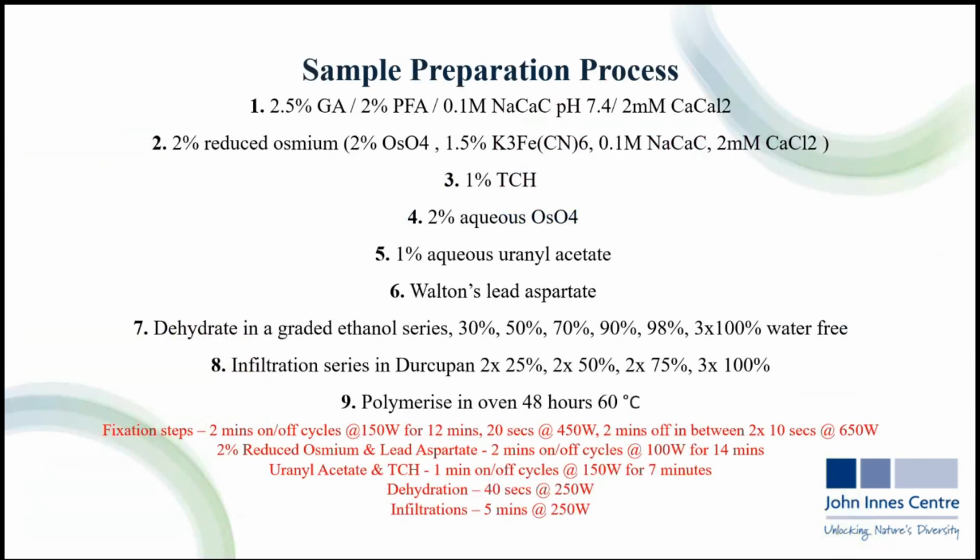This is a protocol that we initially tested, and it has been previously used and successful for plant samples in the BioWave. So this was an obvious starting point since it has shown reliable results in plant tissue preparation for volume EM. The key steps here include the microwave-assisted fixation, dehydration, and resin infiltration. And the advantage of the BioWave here is its ability to accelerate these steps, potentially shortening the process that can normally take days into just hours.